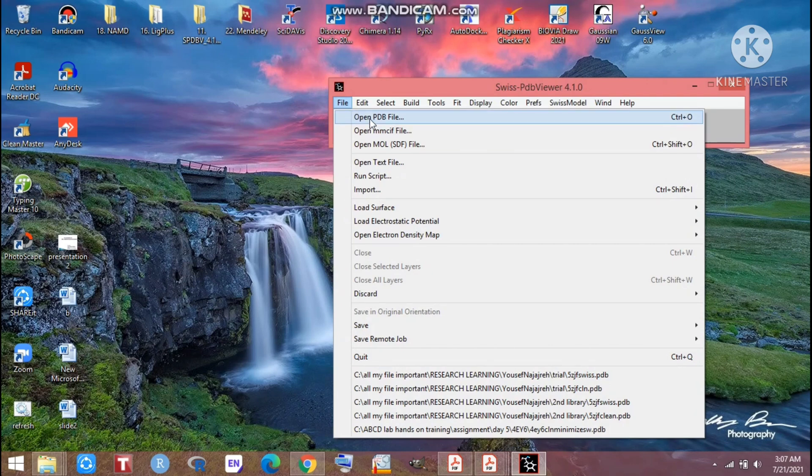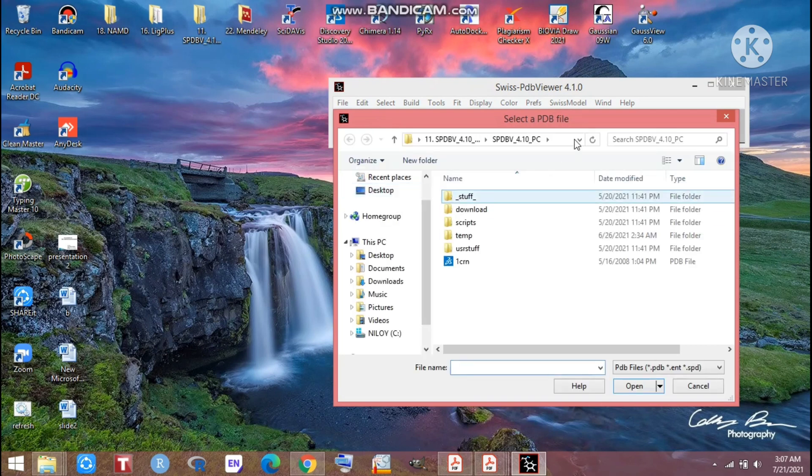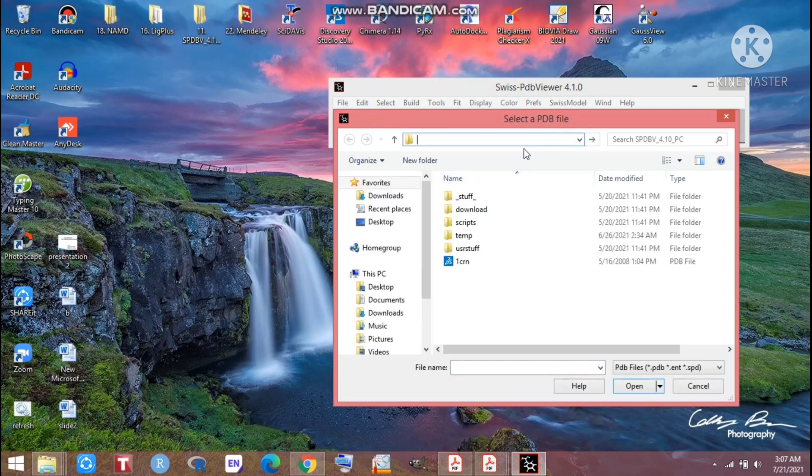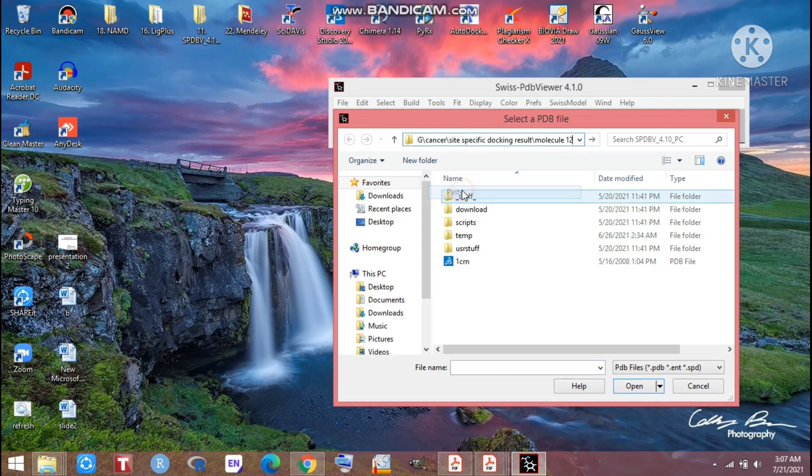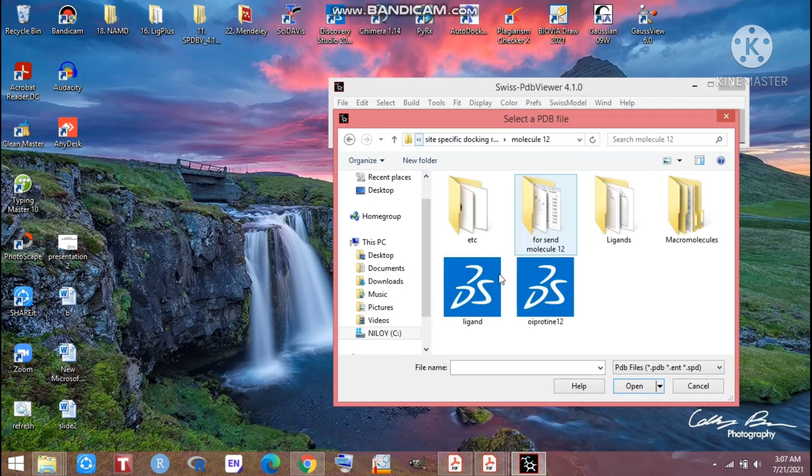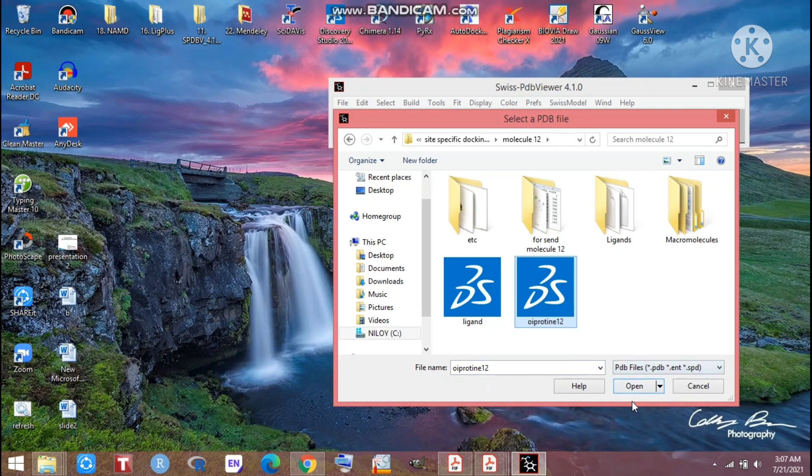As we will just minimize the protein, first of all we have to open our desired protein and that should be in PDB format. I'm just searching for my desired protein. Look at that, that is my desired protein. After clicking that you can easily open it here.